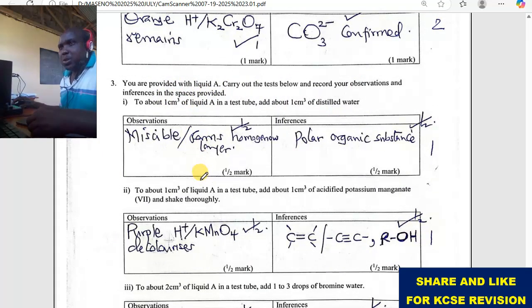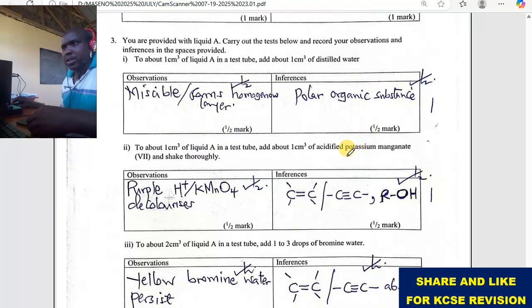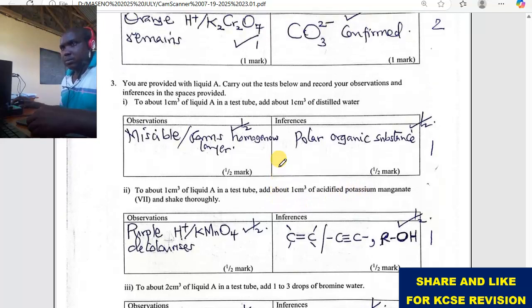Organic. You are provided with liquid A. Carry out the following tests and record the observations. To the first 1 centimeter cube of liquid A, add 1 centimeter cube of distilled water. Now we have a liquid and we are adding distilled water.